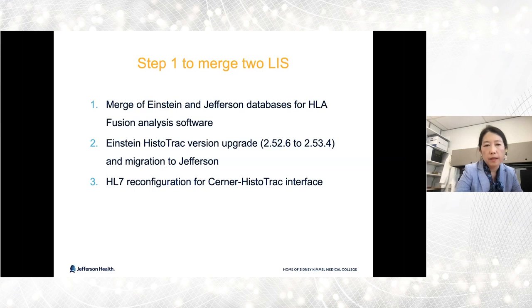Then the third component is HL7 reconfiguration to make sure the Cerner HistoTrac interface still remains intact. So the first go-live date was March 22, 2022.